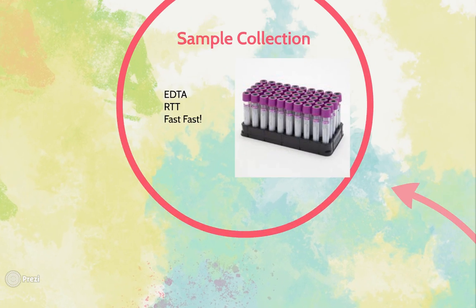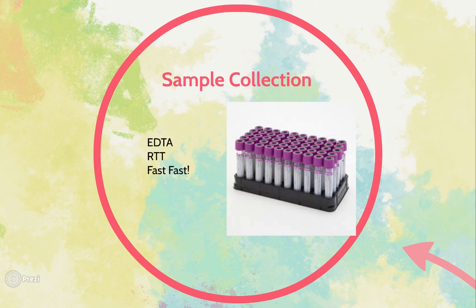And then for your samples, we said to collect some in EDTA. The main thing with EDTA or your samples in general that you're going to use for cytology, process immediately. Can't stress that enough. Most of the time, unless it's an extremely cellular sample, you'll need to centrifuge these fluids down. So 5 minutes on a urine setting in the centrifuge is acceptable. Centrifuge them down and then draw the cells from the very bottom of the tube.